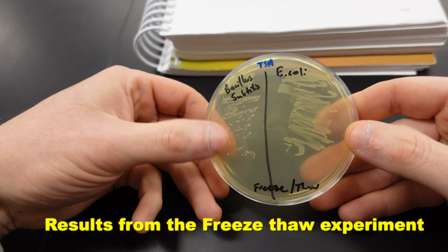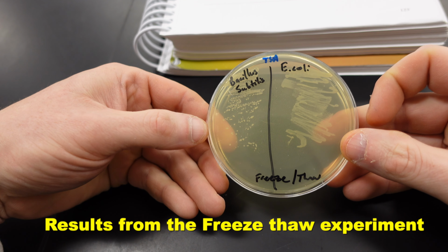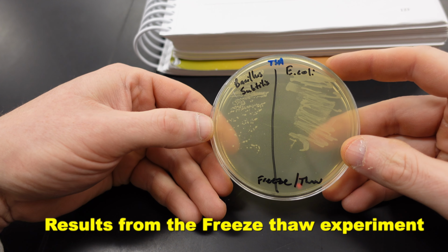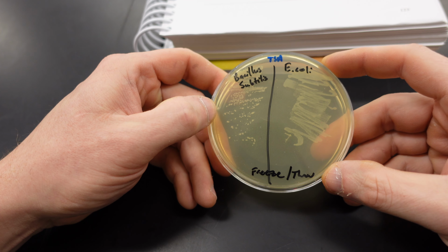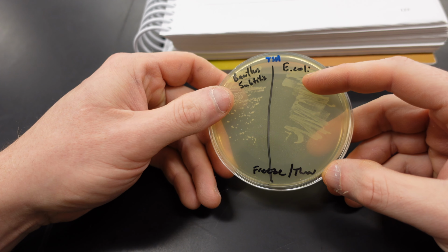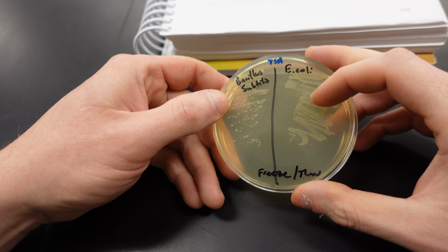Freeze-thaw. Here we have Bacillus subtilis, we have E. coli, and you can see that even after freezing and then thawing, both of them have growth. So freezing is a method of preservation. It is not killing the bacteria. So even though Bacillus forms endospores, E. coli does not, the freezing has no effect on the ability to grow.